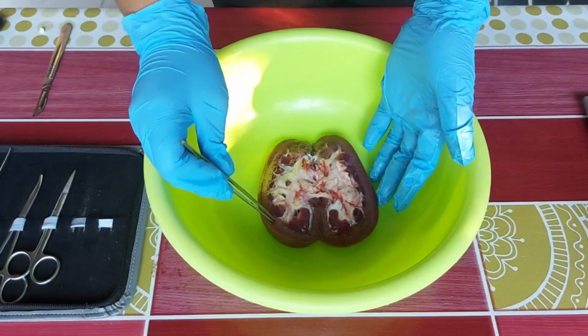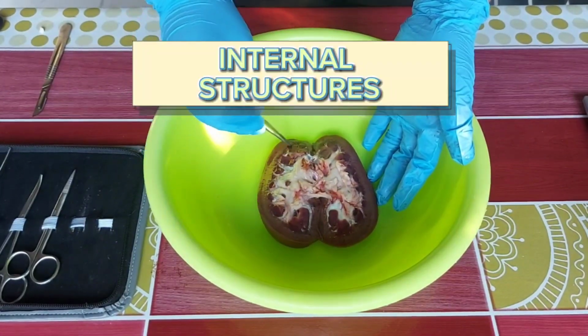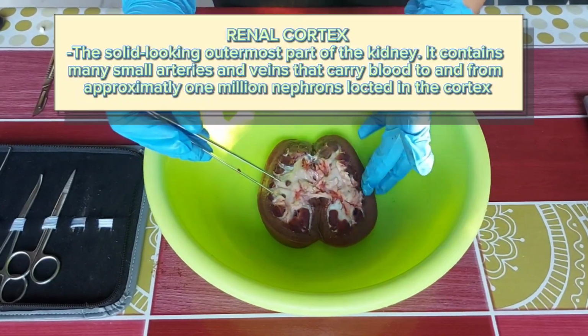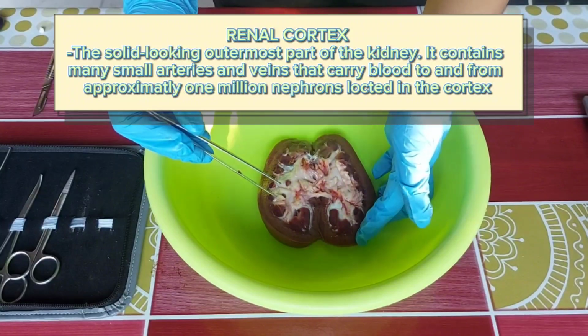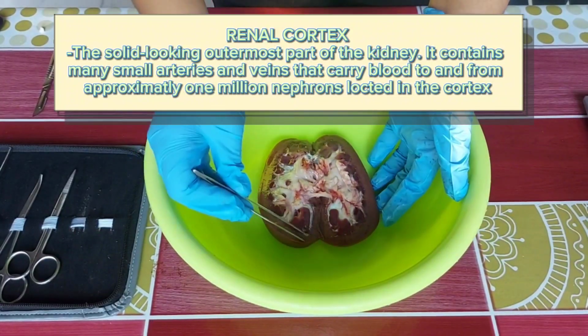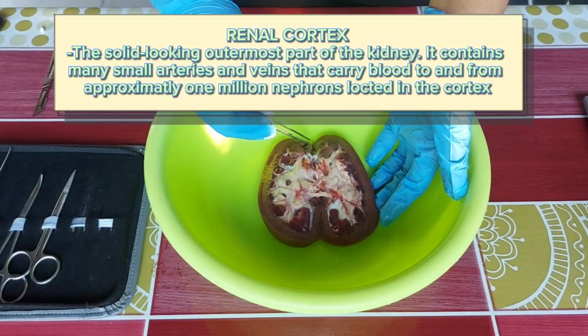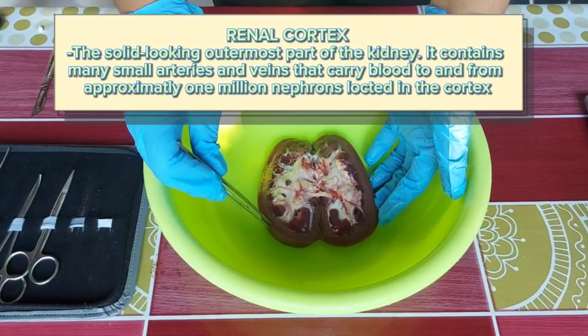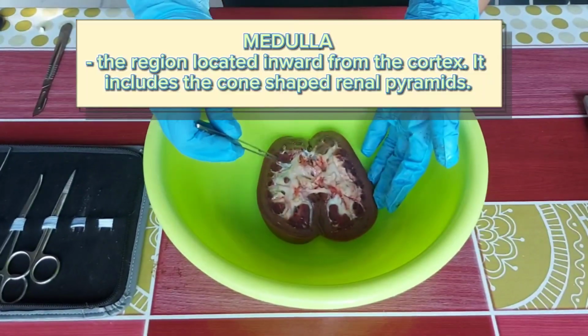After cutting the kidney, let's now examine its internal structures. This is the renal cortex. The renal cortex is the solid-looking outermost part of the kidney. It contains many small arteries and veins that carry blood to and from approximately 1 million nephrons located in the cortex. This is the medulla.